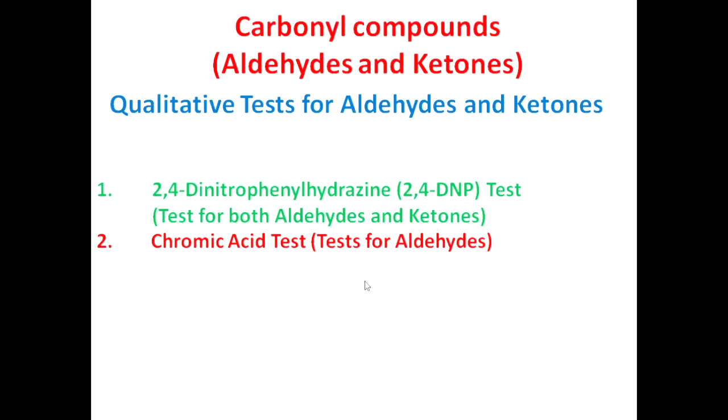Dear students, today we are going to see about our carbonyl compounds qualitative test. We know that carbonyl compounds consist of aldehydes and ketones, and we also know that aldehydes behave differently as well as ketones behave differently.